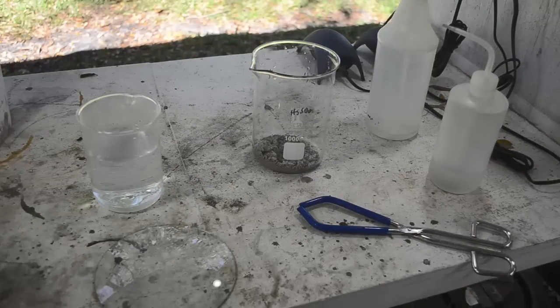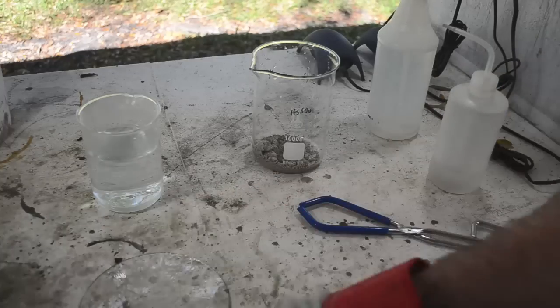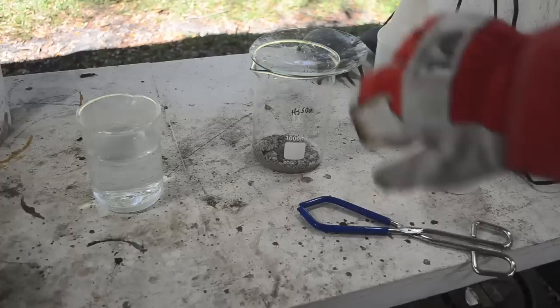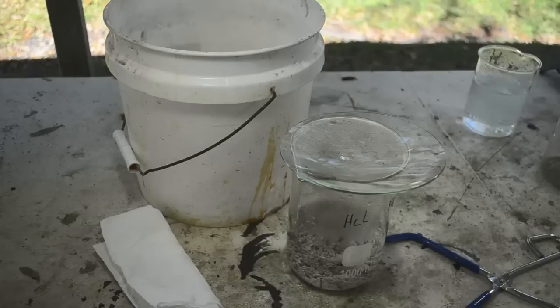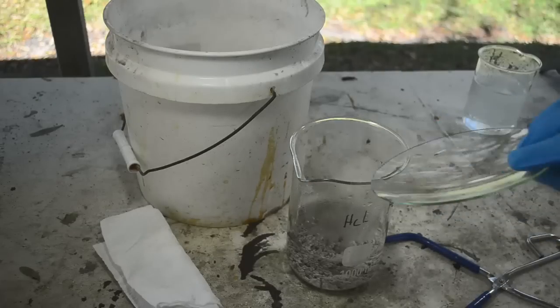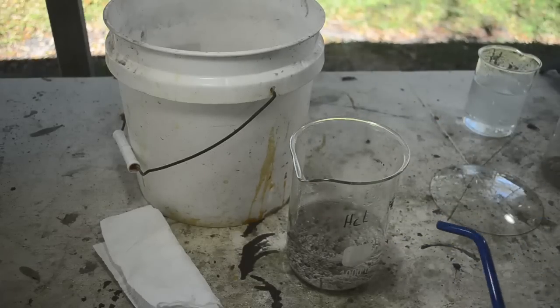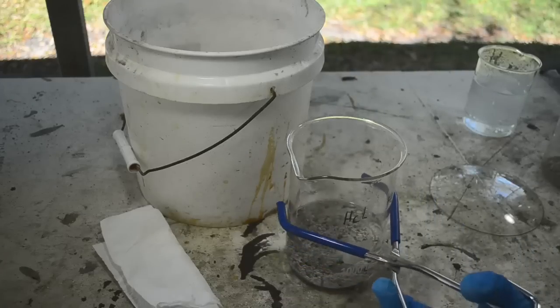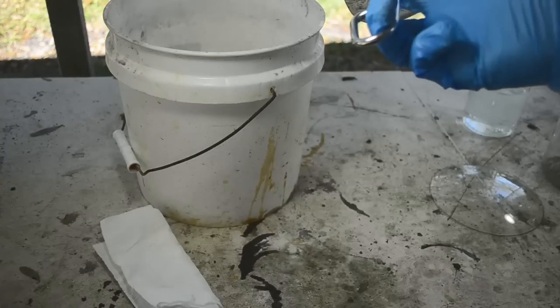And let me get the other one off the heat so it'll quit boiling. So they both had about the same amount of boiling time. And then we'll start rinsing both of these. Now, unlike with the sulfuric acid one, I have to say, I don't really see any tint to this liquid. It does not look like it has any color to it.